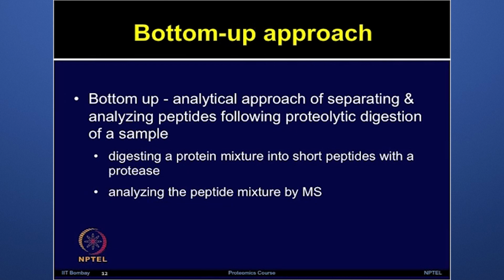Let us now discuss the bottom up approach. This is an analytical approach of separating and analyzing peptides following the proteolytic digestion of a sample. Let me give you the various steps involved.